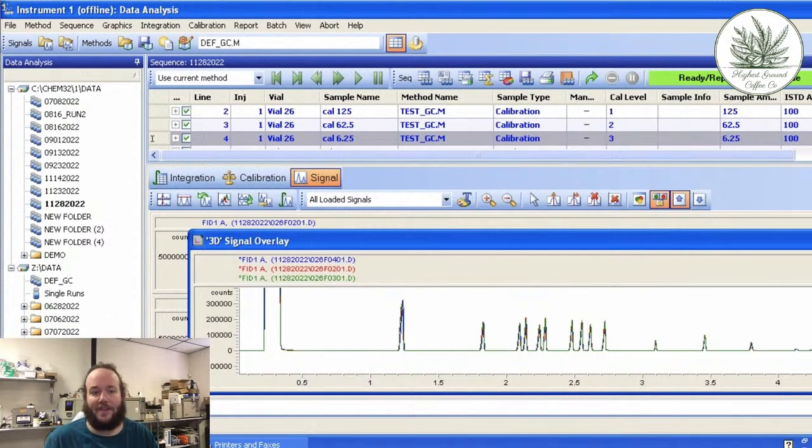What we look for with the internal standard is it helps us to know that the amount of solution injected is consistent. And when it's not, you can use the amount of internal standard found at a calibration point, and then you can use your sample injection internal standard amount, and then you basically cross-reference the two, right?